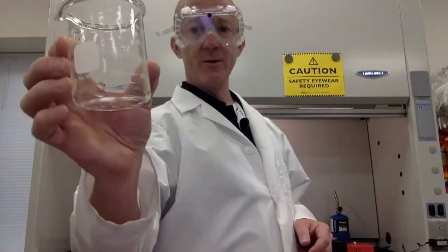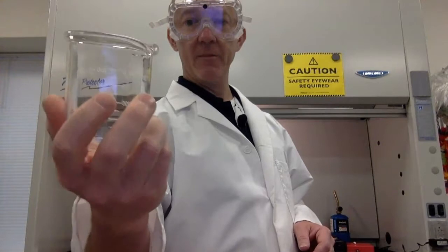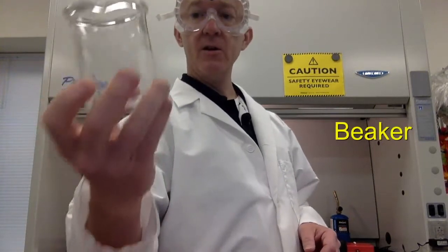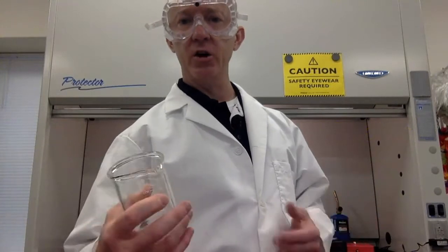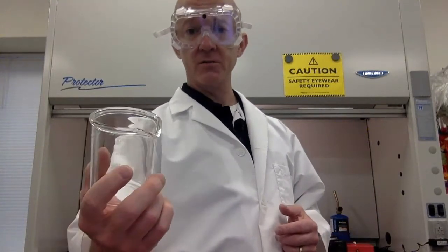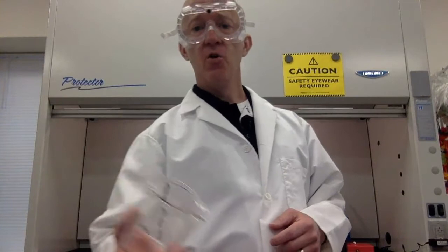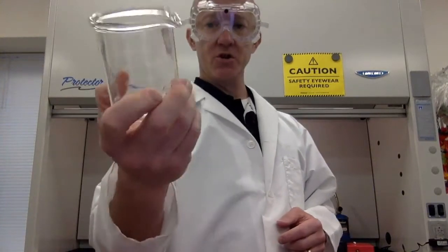Let's get right into it. We'll start with this, the workhorse of the chemistry lab. This is a beaker. Now beakers are used when you have a situation in which there's very little likelihood of splattering to take place. Reactions that aren't very vigorous, or just plain mixing. A beaker is used for that.